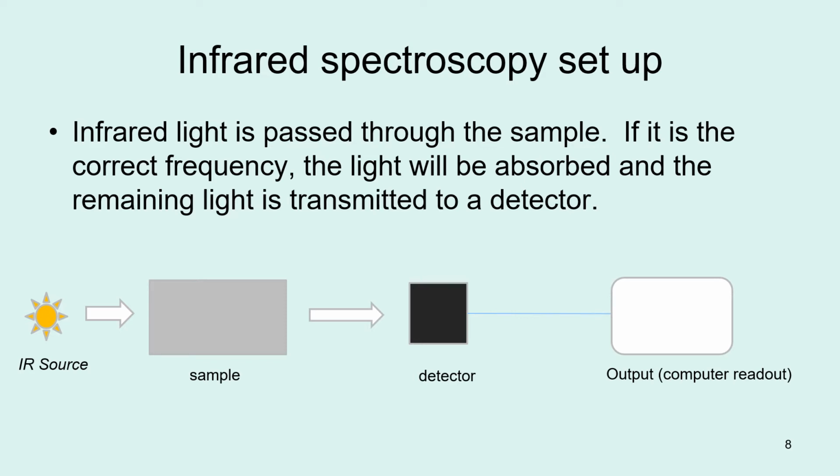You can also think, as you'll see in a second, absorption and transmission are two things. If you think of it as absorbance, how much is absorbed, this side will be less. You can also think of it as how much of this light gets transmitted through, and those are opposite things.